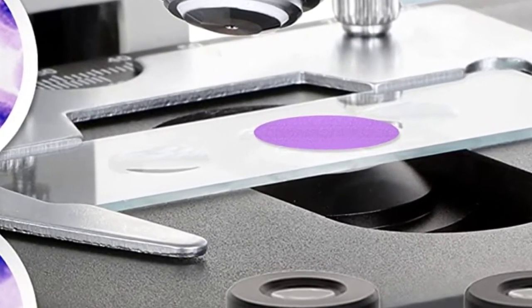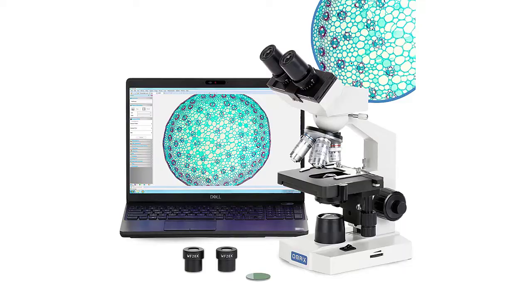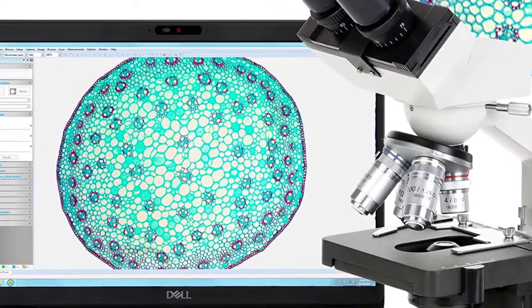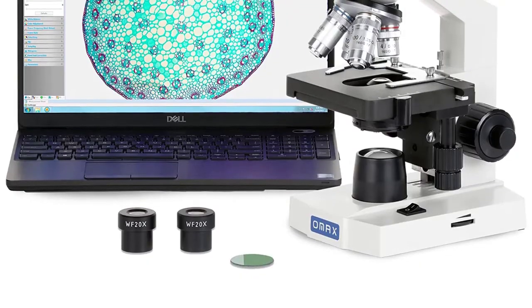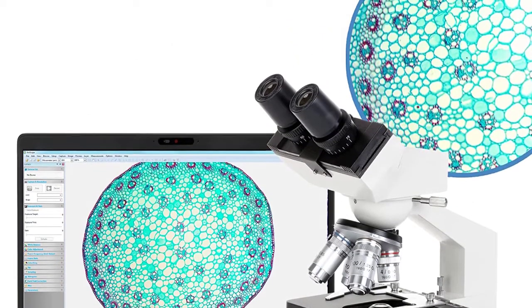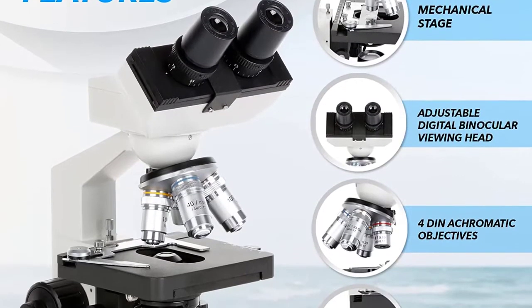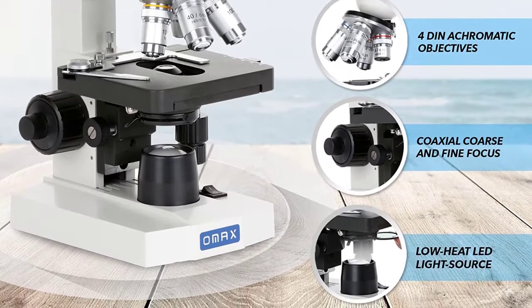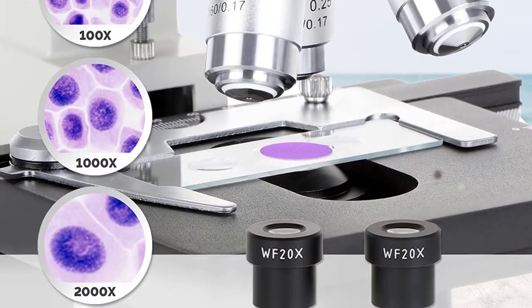Total magnification: 40x, 80x, 100x, 200x, 400x, 800x, 1000x, 2000x. Eyepieces: wide field WF10x and WF20x. Objectives: achromatic 4x, 10x, 40x, and 100x oil. Nosepiece: revolving quadruple. Stage: double layer XY mechanical stage with scales, 115mm by 125mm, translation range 70mm by 30mm. Stage upward moving lock protects objectives and slides.